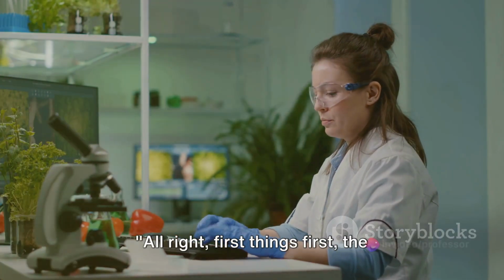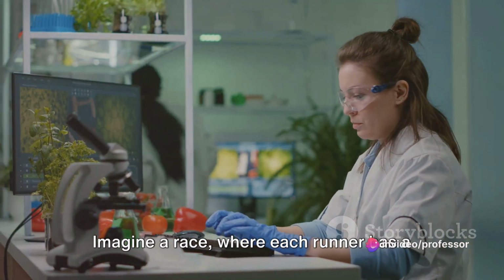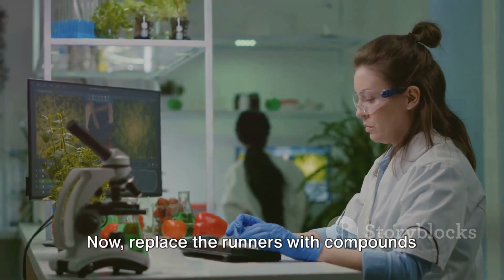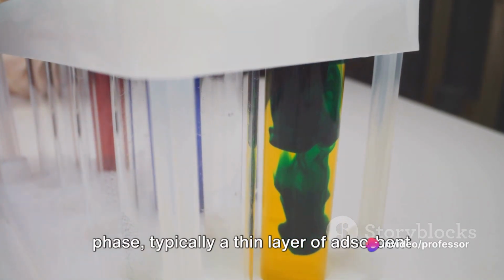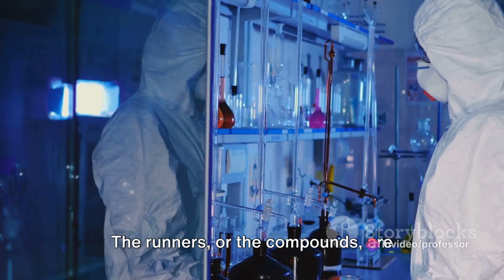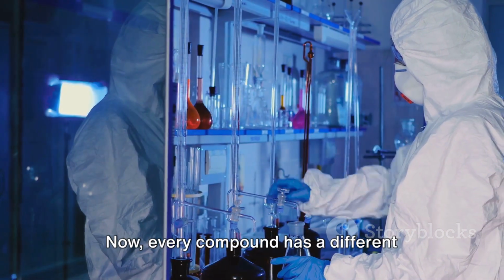Alright, first things first, the principle of thin layer chromatography, or TLC for short. Imagine a race, where each runner has a different speed and endurance. Now, replace the runners with compounds and you have TLC. Here, the racetrack is the stationary phase, typically a thin layer of adsorbent material spread on a flat inert substrate. The runners, or the compounds, are carried forward by the mobile phase, which is a suitable liquid solvent.